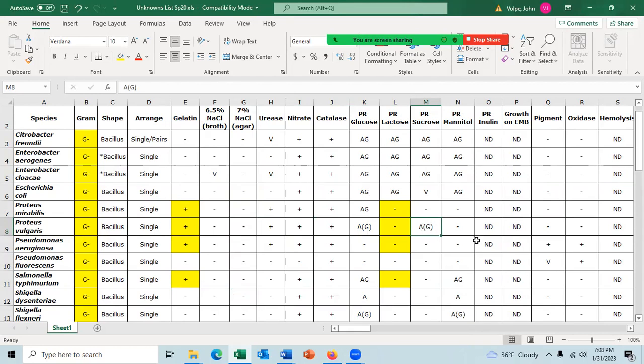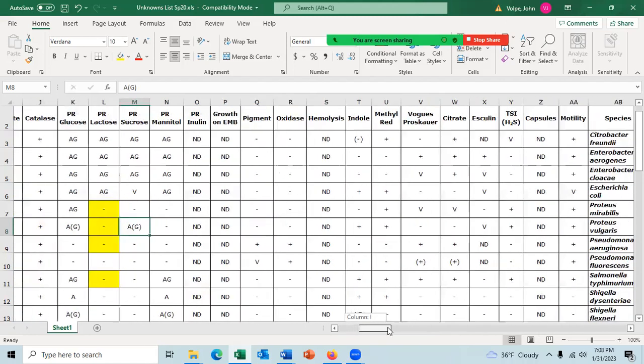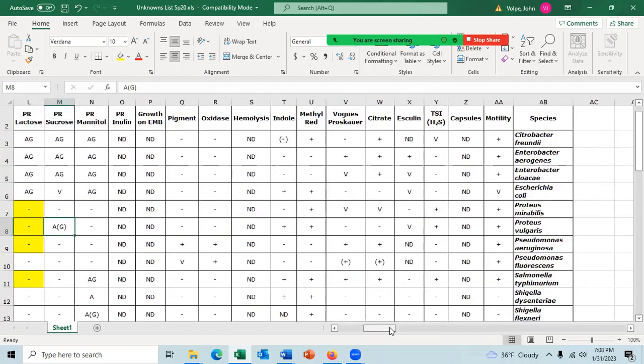I'm trying to look at a better one. Here's a good one. Nope, that's not the right one. Sorry. Let me come on over here. Here's a good one. Yes, this would be a good one. If you did the indole test next and it is positive, you narrow it from four down to two.